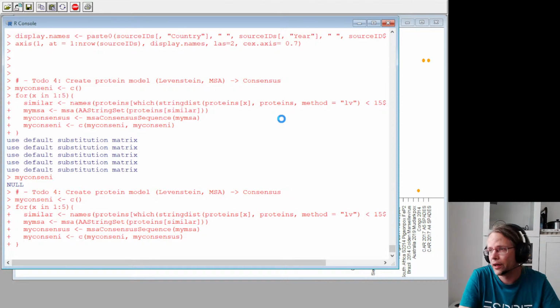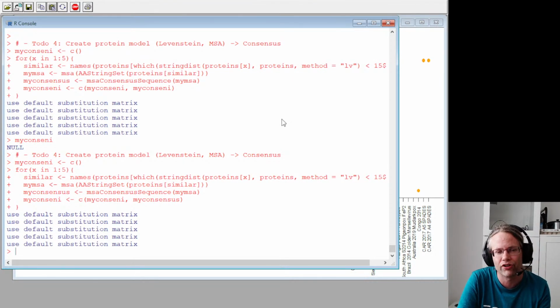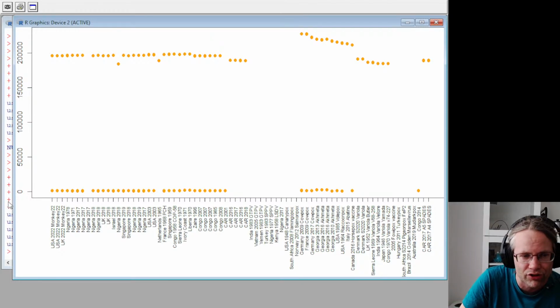So you do it for 1, and then you start saying, well, what would happen if I would now look at 5 genes, or if I would look at 6 or 7, right? How would the genome structure change? And of course, we can also just zoom in, right? We don't have to look at this because, hey, of course, there's distance. So there might be that some genes are longer than other genes, which we already saw from the consensus sequence.